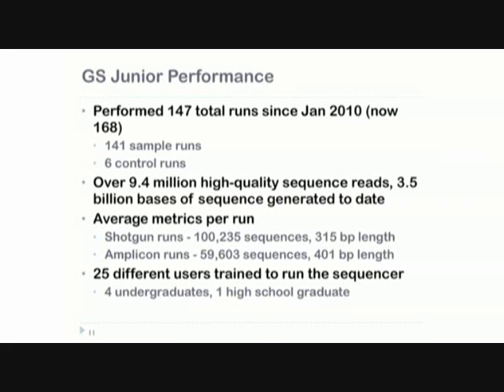We've used it to understand immunogenetics in non-human primates. We've used it to look at MHC expression in distinct lymphocyte subsets. As Shelby briefly alluded to earlier, we've been looking at KIRs, and just this week we got our first T-cell receptor data off the machine.